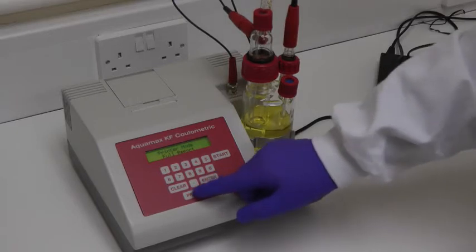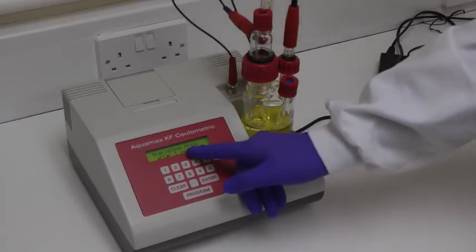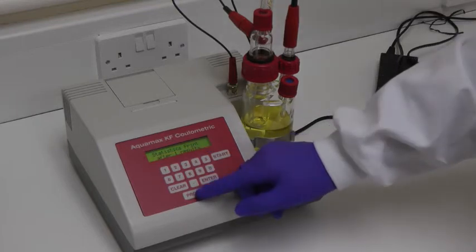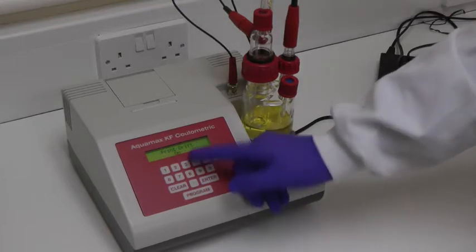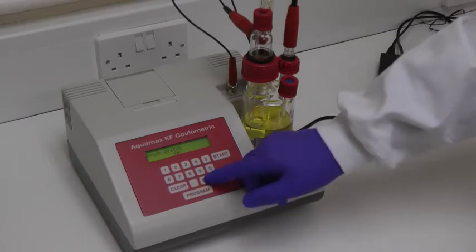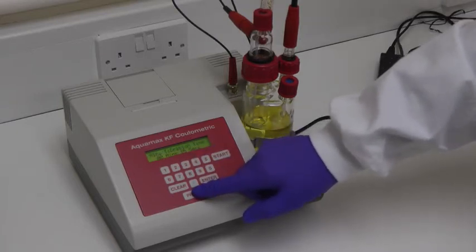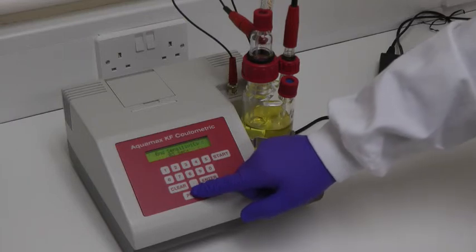The Statistics Print parameter will print statistical data from a series of up to 99 results. The Background Drift Print option may be either On or Off. Other parameters allow delay times to be programmed, minimum titration times to be set, and the sensitivity to be changed.